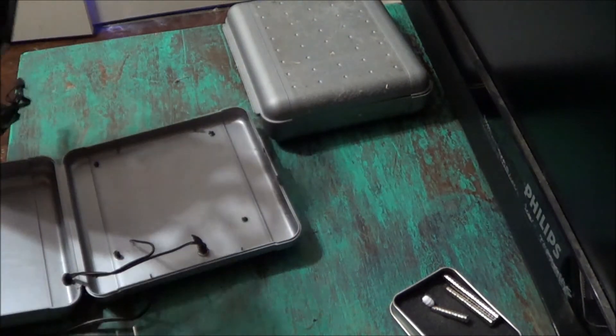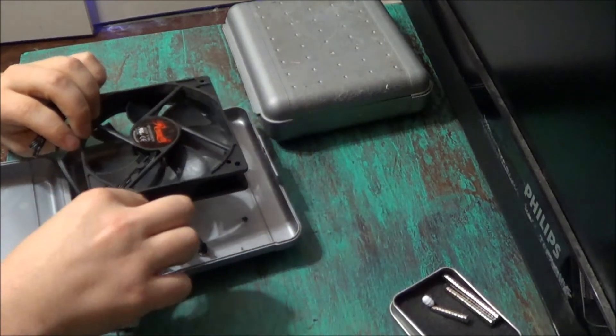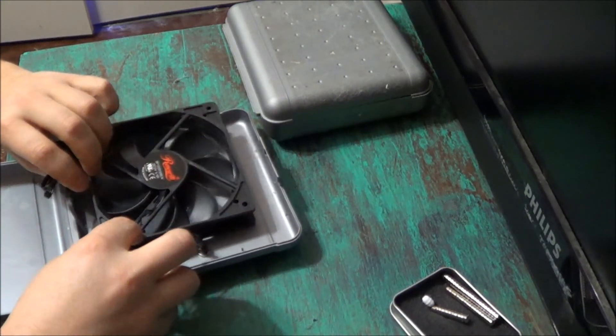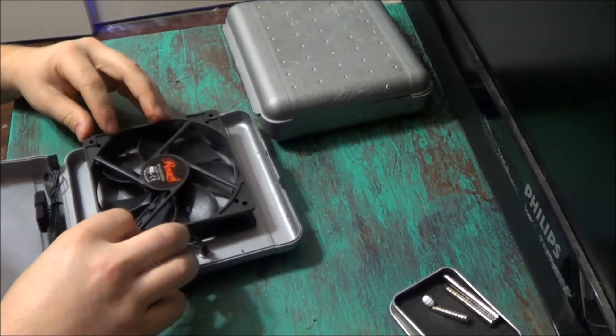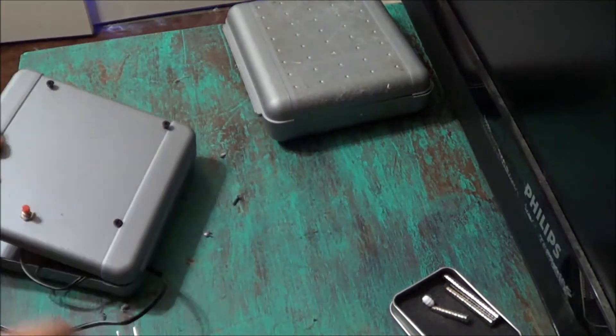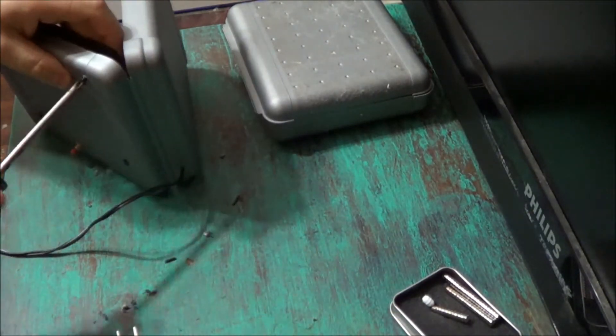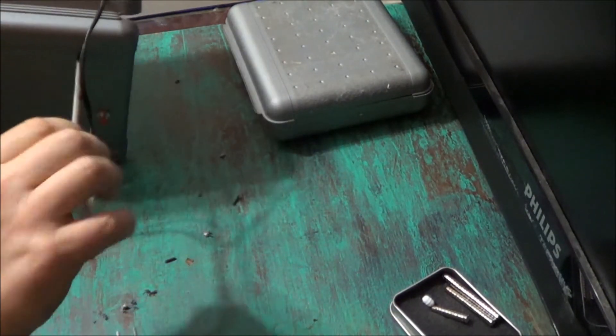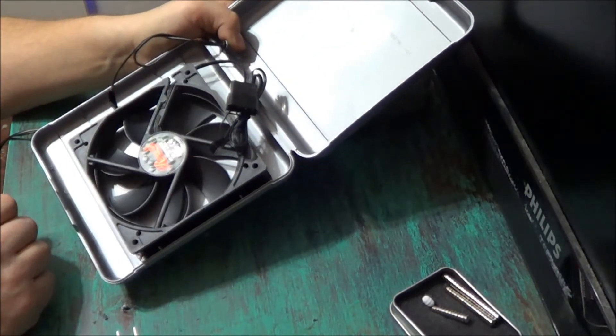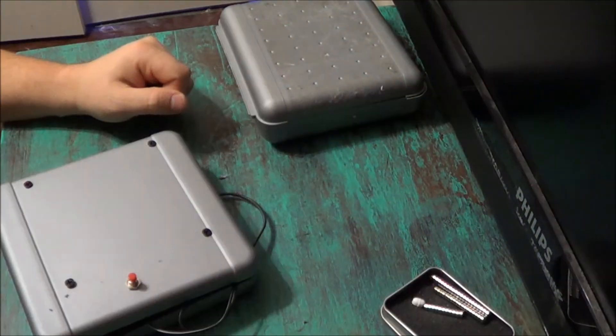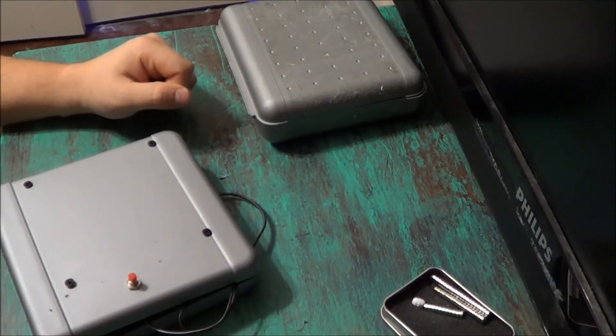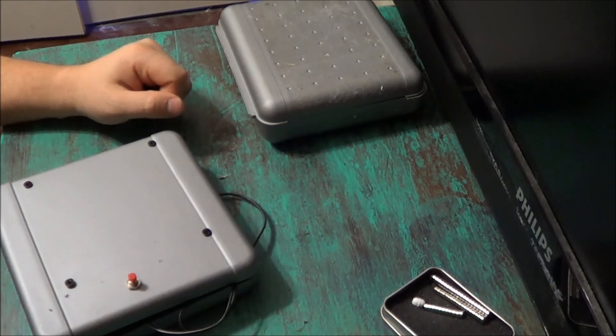They're not going to go off up towards the top of the box. Now we're going to wire our fan up to the power switch.